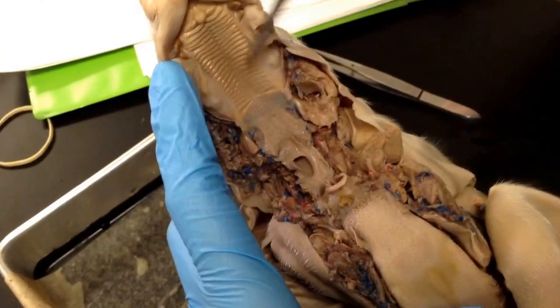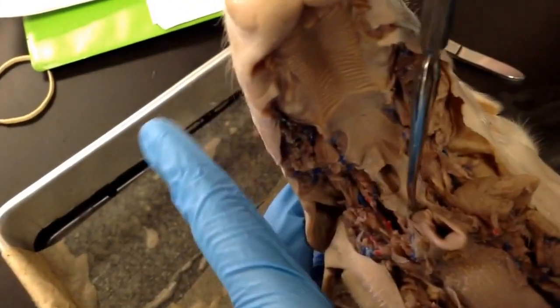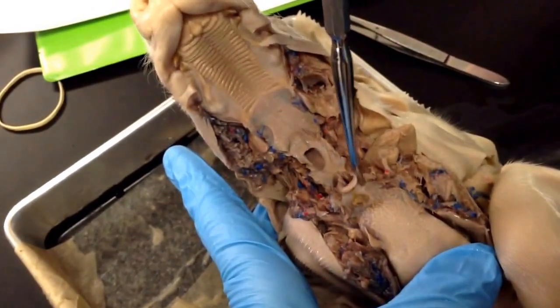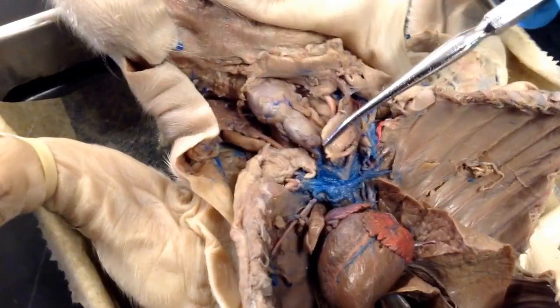So that area is the hard palate. That's the soft palate. That's the oropharynx, which is the opening to the nasopharynx. Right in there is the esophageal opening. That is the glottis, and the little covering thing that closes over it is the epiglottis. And that's the tongue. Pharynx.